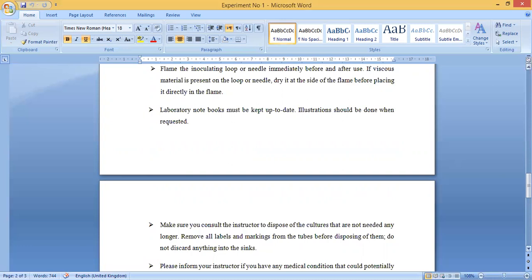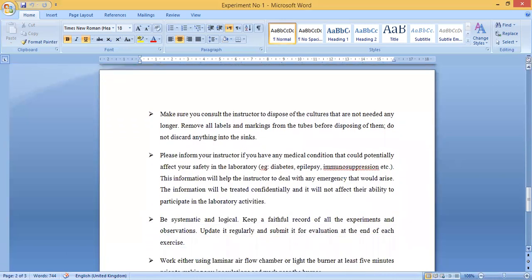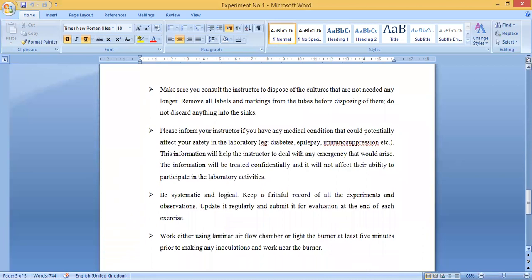The laboratory notebook must be kept up to date — this is also important from an exam point of view. You must complete all practicals on a regular basis, and illustrations should be done when requested. Consult the instructor to dispose of cultures that are no longer needed. Remove all labels and markings from tubes before disposing of them. Do not discard anything into the sink, as it can get choked and cause contamination.